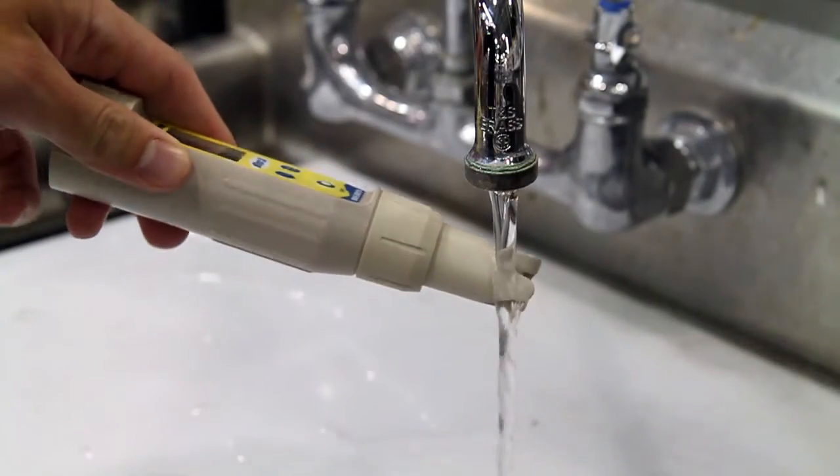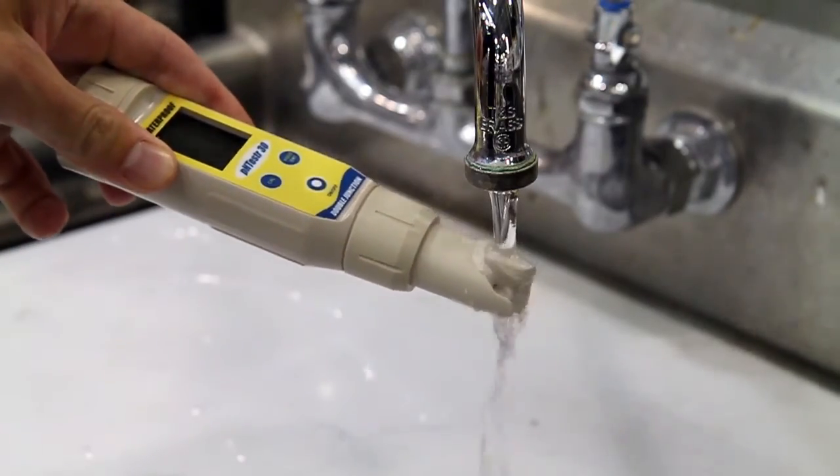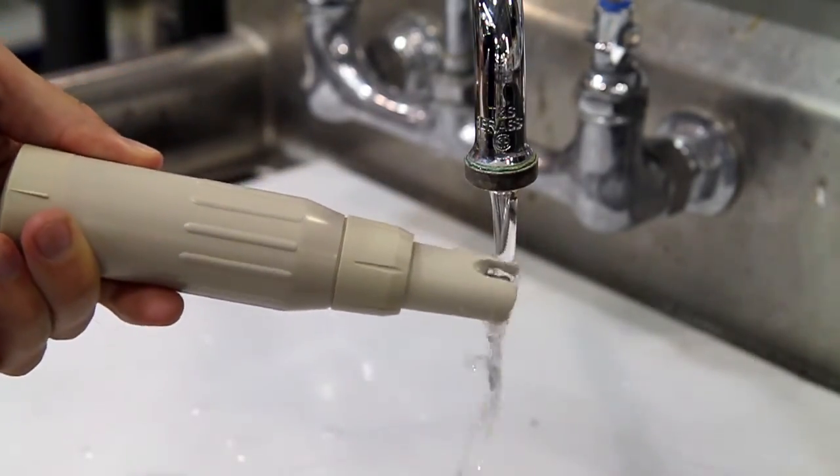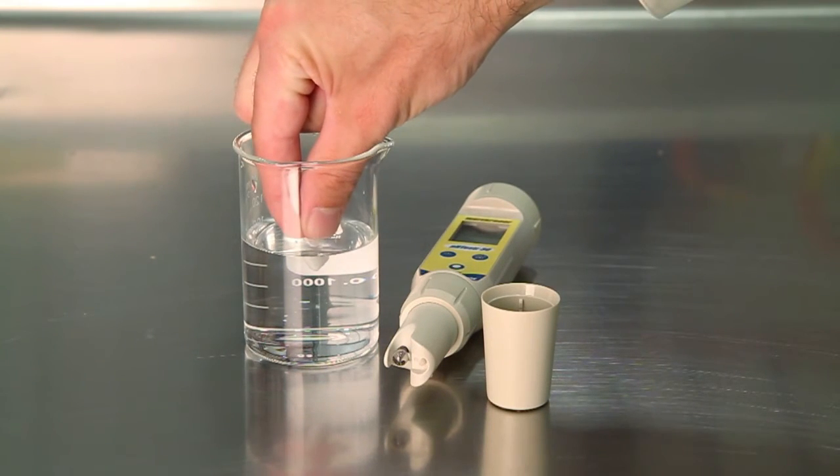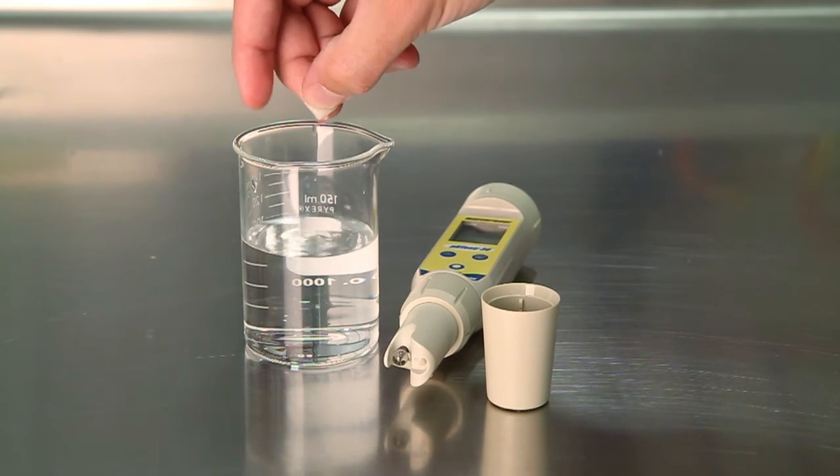Electrode maintenance. Rinse the electrode with tap water or electrode storage solution after each measurement. If possible, keep a small piece of paper or sponge moistened with electrode storage solution in the electrode cap.